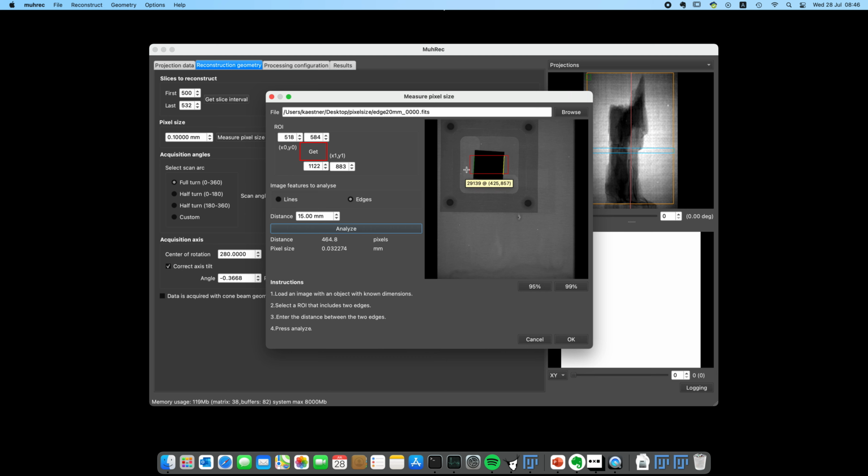The difference here is if you look at this image here, you have a green line and a yellow line. So what this little widget is doing is actually to identify where you have the edge lines, and then it computes the shortest distance between these two, hopefully parallel lines. And with that, you get a more accurate and reproducible result than if you try to drag in ImageJ, try to drag along and see where it is. So you can be pretty imprecise in where you select the box, but afterwards it finds it.